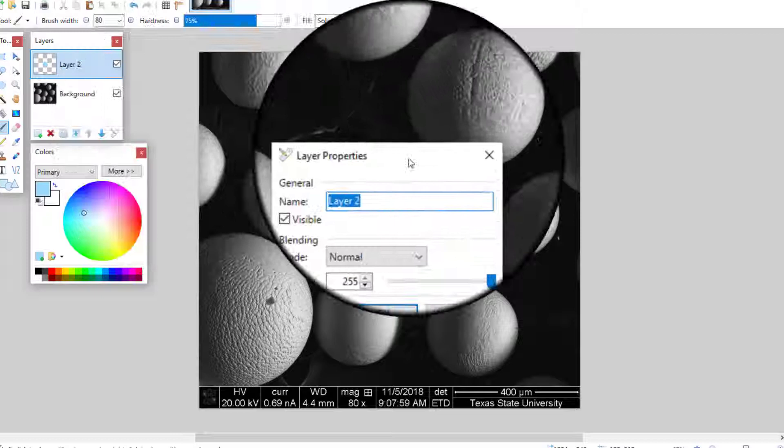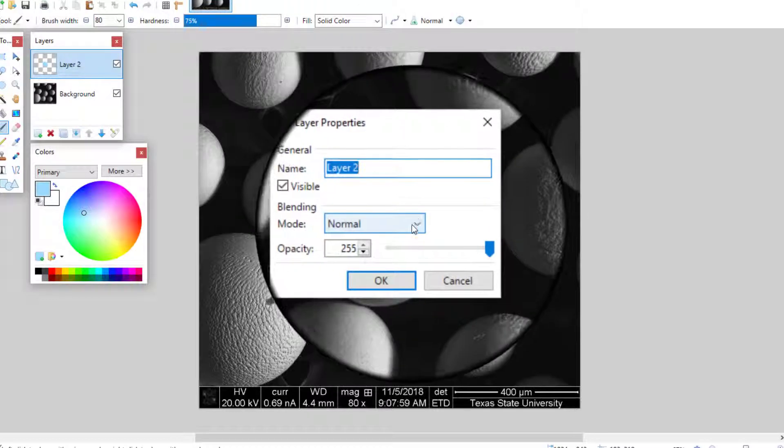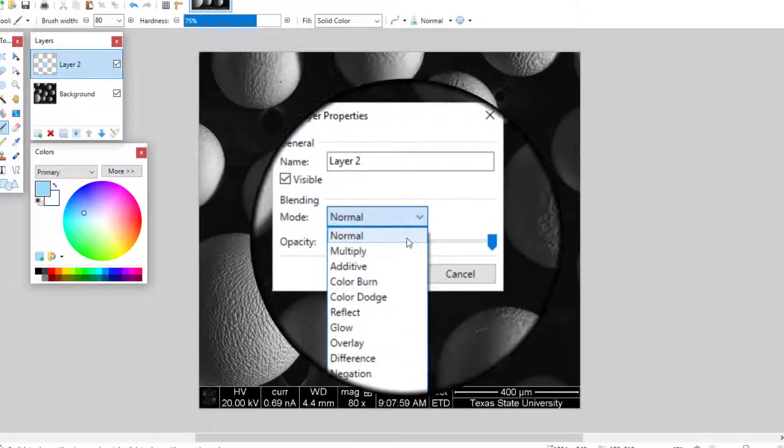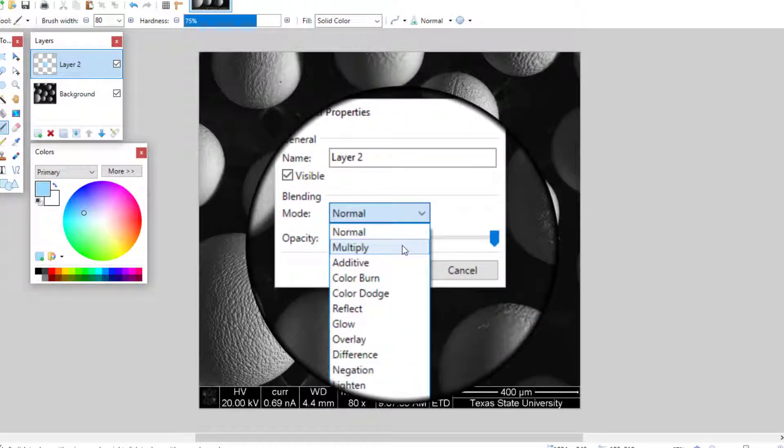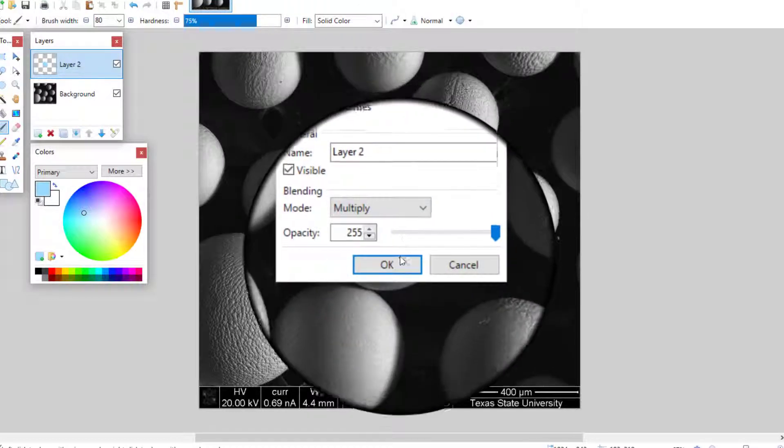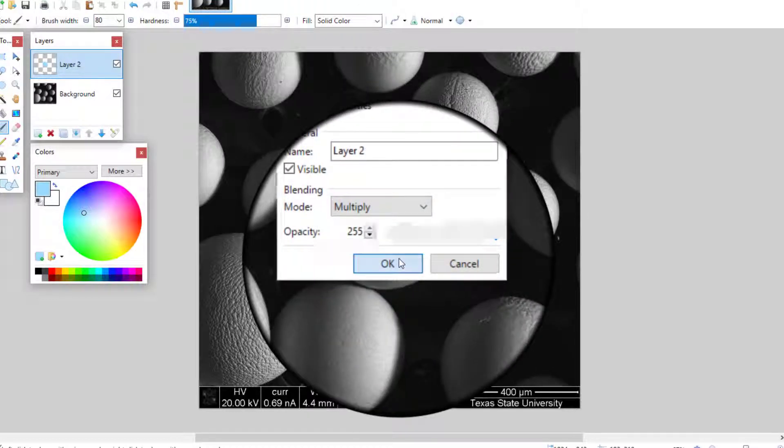Finally, go to the Layer Properties menu and change the Blending Mode to Multiply to add the color to your image.